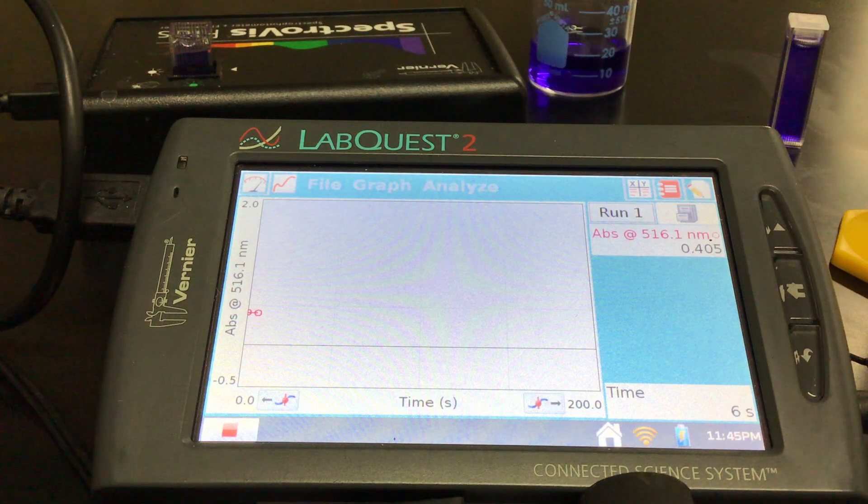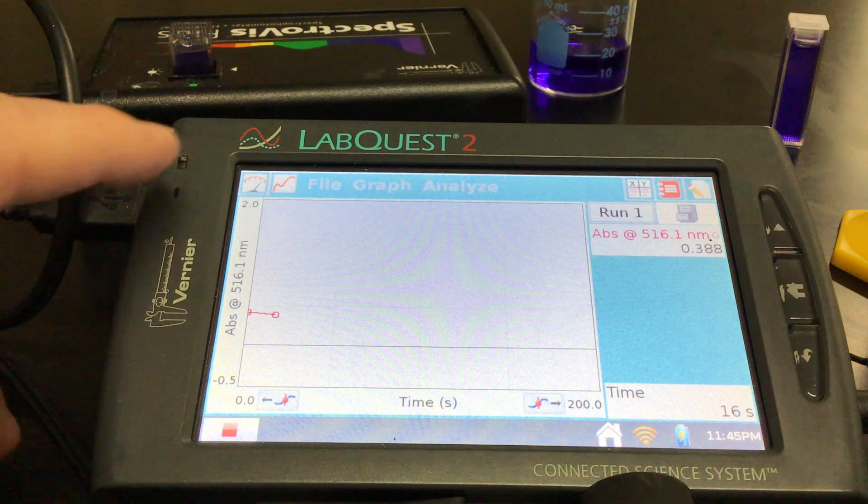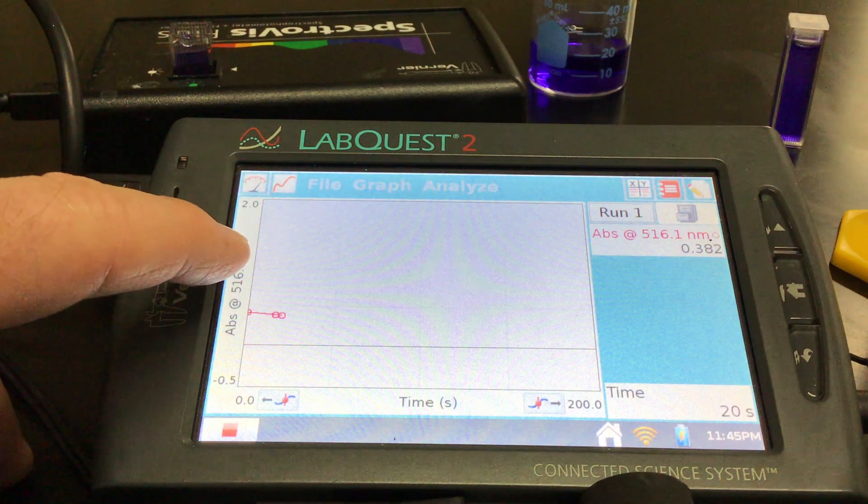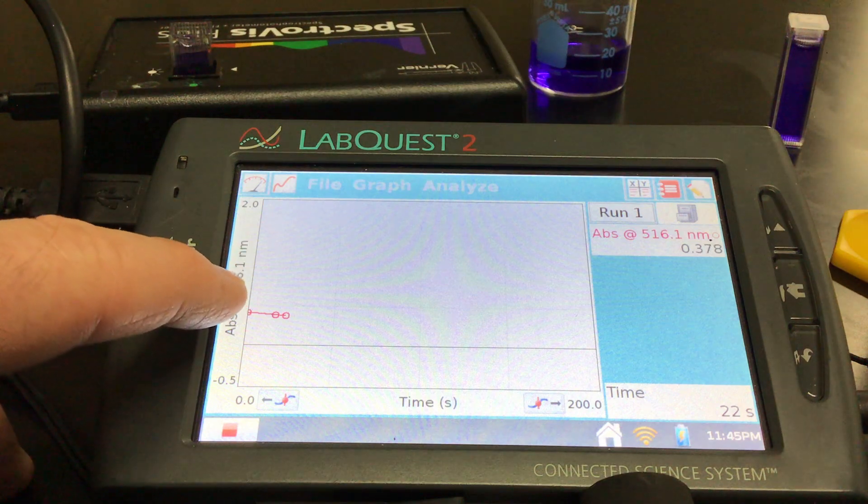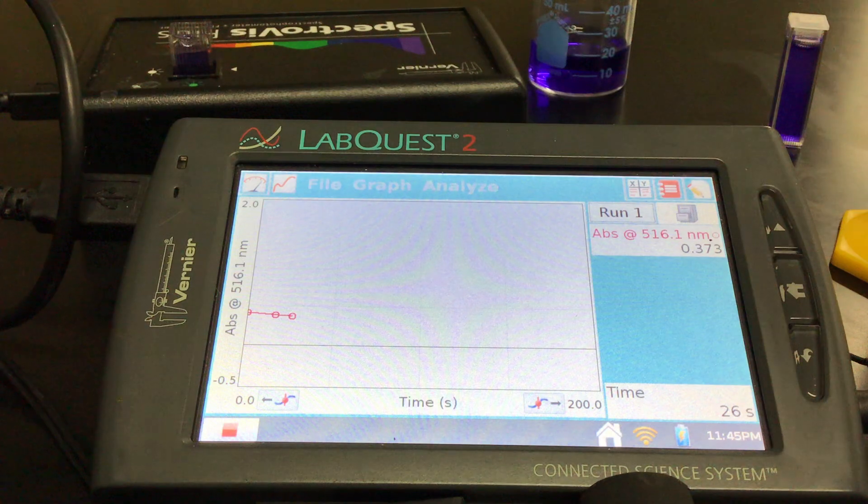It's going to be about 200 seconds here before we get a graph. It might look like maybe something's going wrong at this point but really it isn't. The scale is up here at two; if halfway through is one we can see this is below that. The absorbance started around 0.37, 0.4 somewhere around there, so we're in good shape.